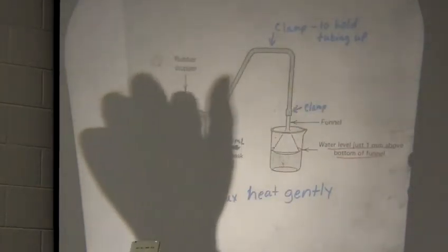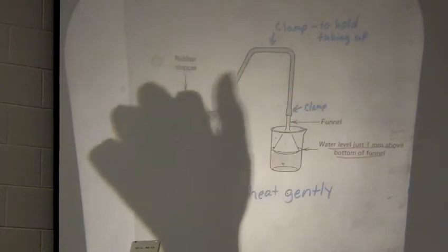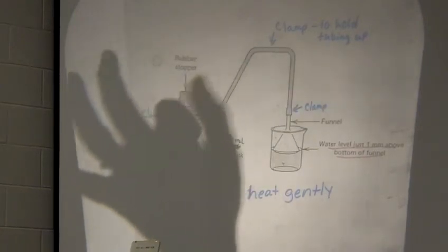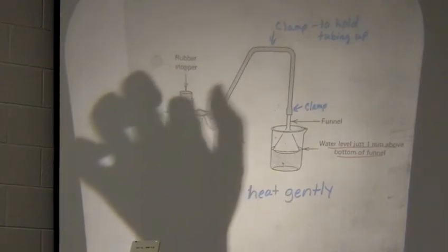Because of the HCl gas that is generated, we're using the filtering flask to help us have a way to get rid of that HCl gas, okay? So this is what we're going to call our trap for that HCl gas. So we've got a hose going from our filtering flask. It's going to be clamped up here.